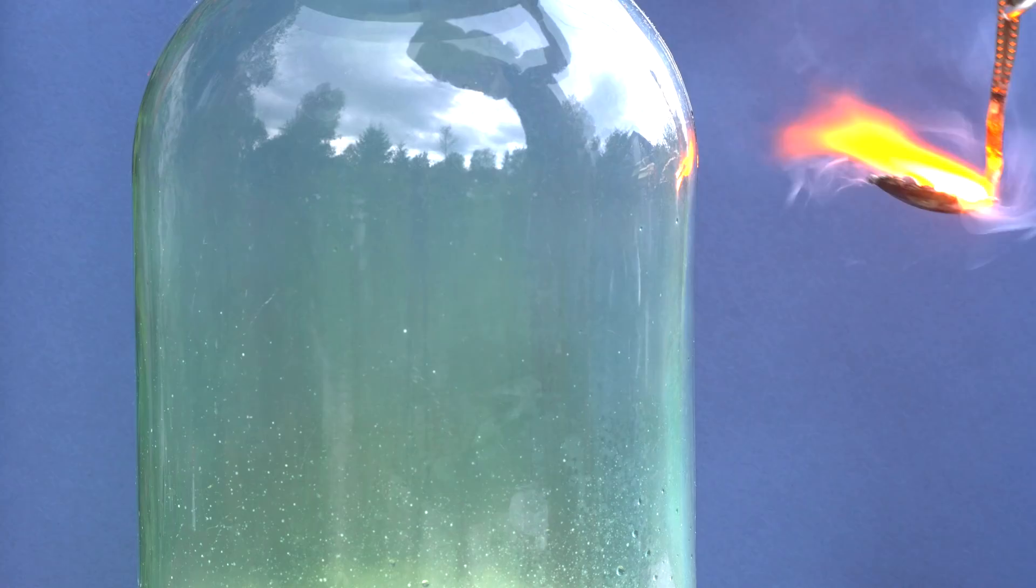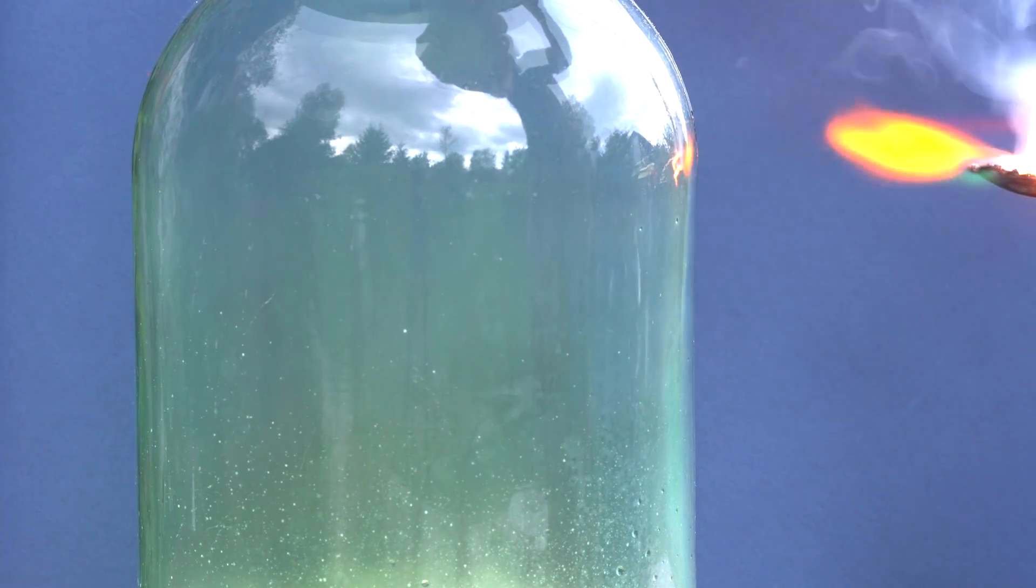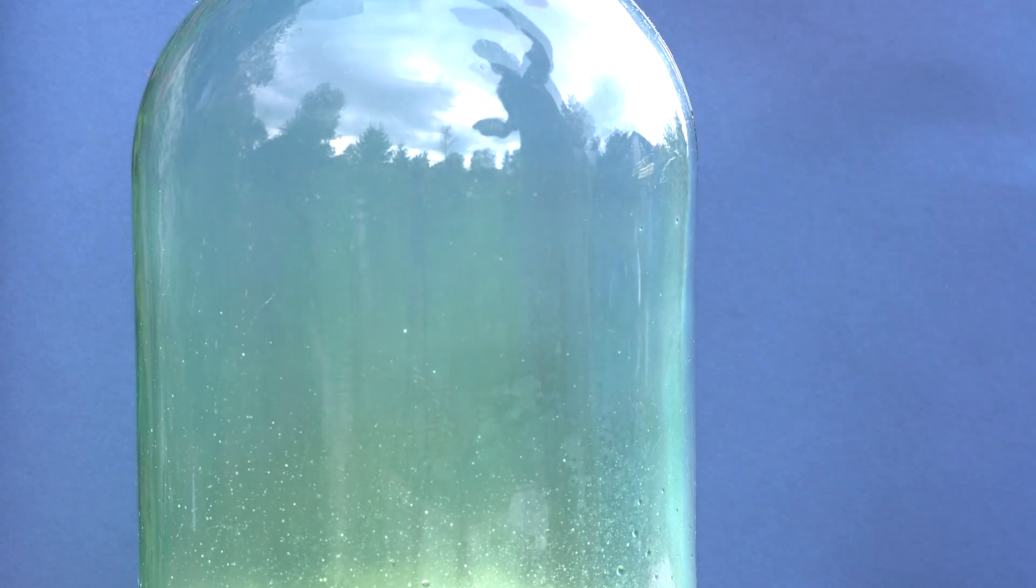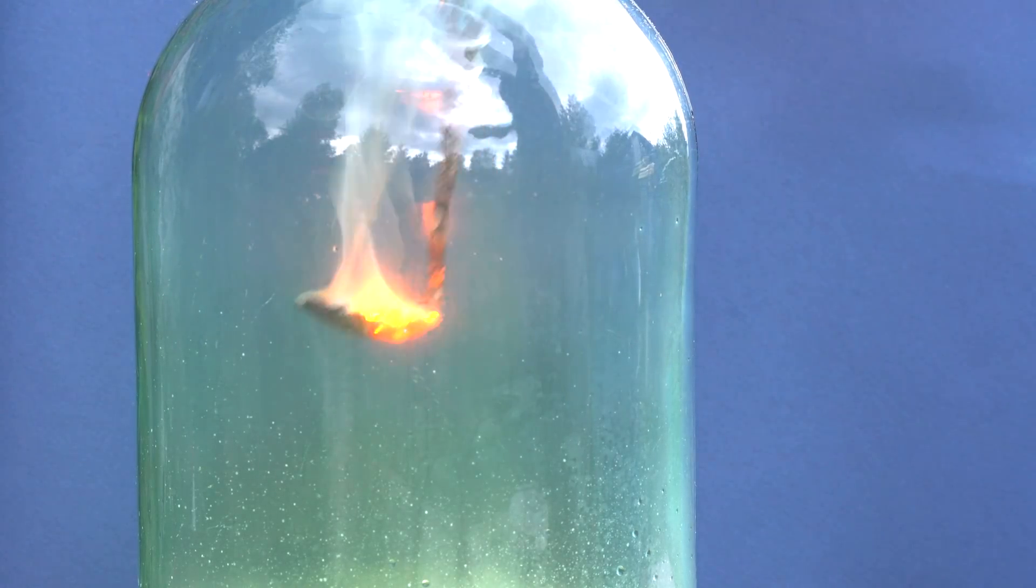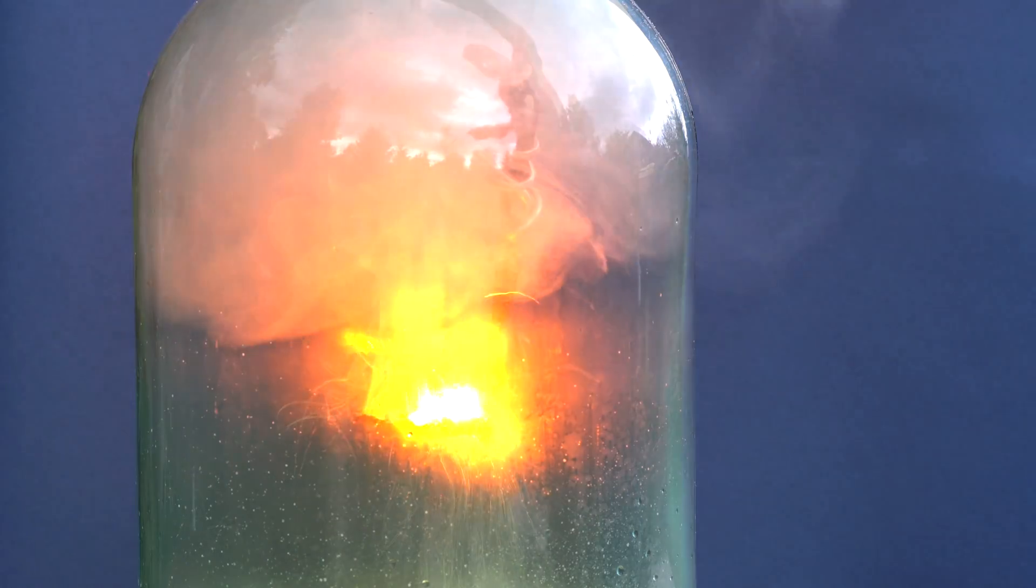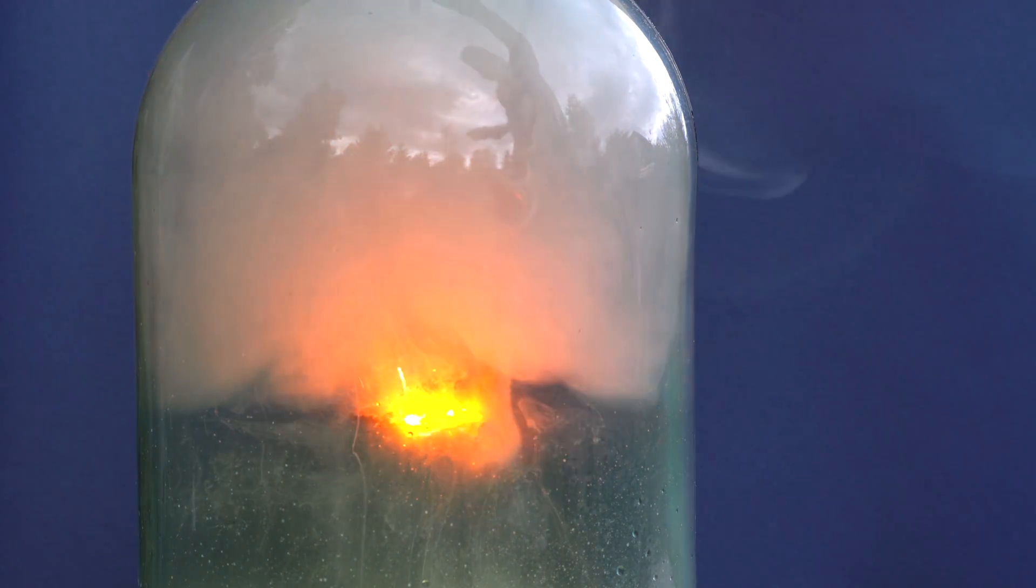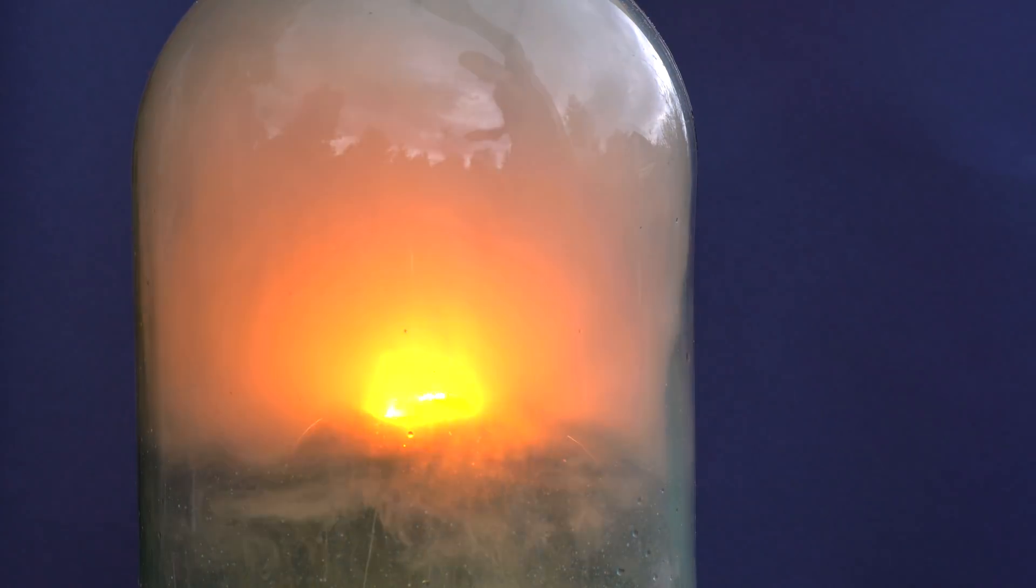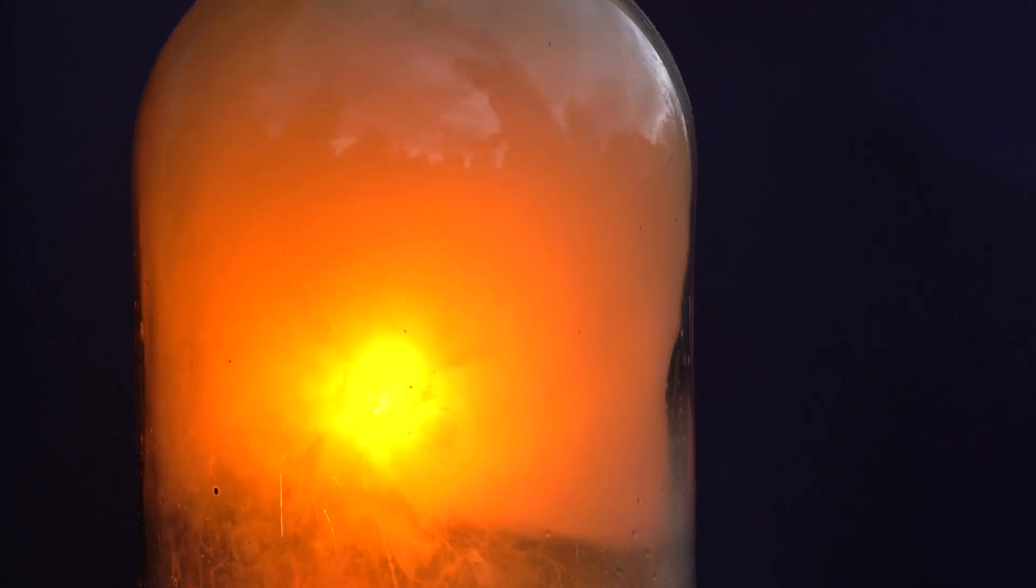I heated lithium with a burner so that it could melt and catch fire, after which I lowered it into the flask with the chlorine atmosphere. It is immediately evident that in the flask with chlorine, lithium burns much brighter and faster, forming smoke of lithium chloride.